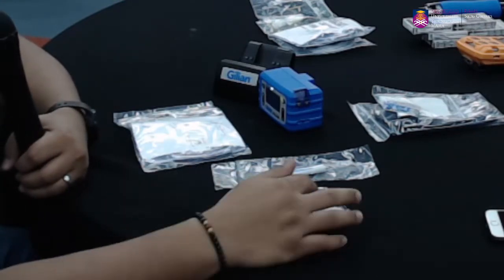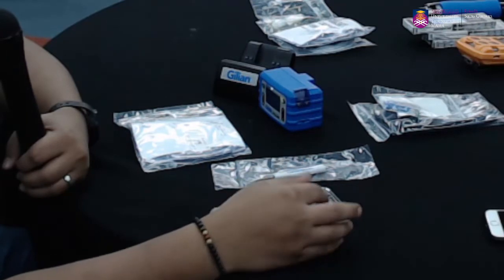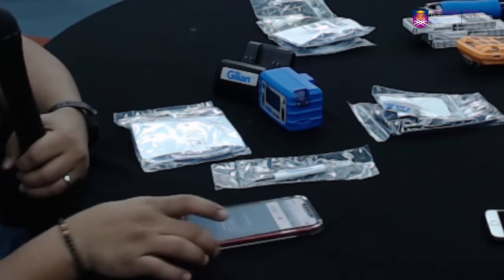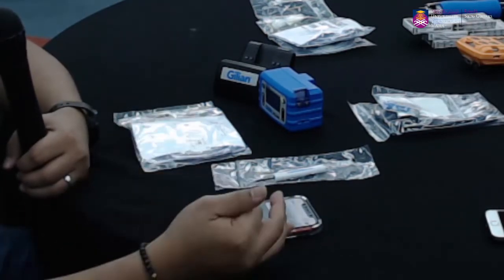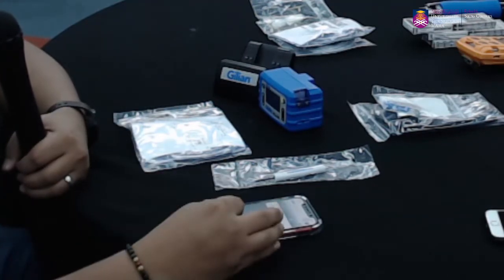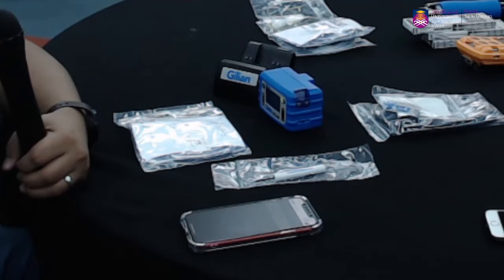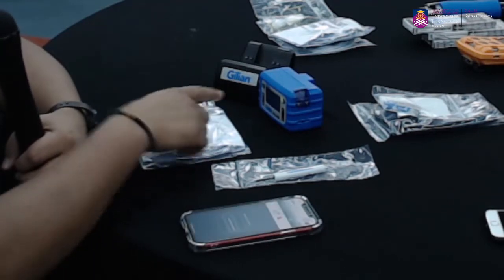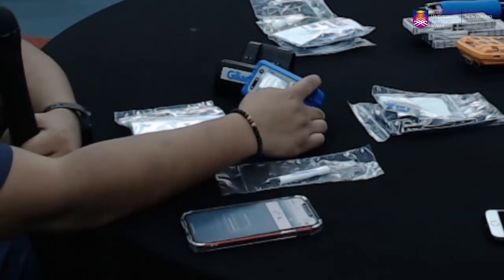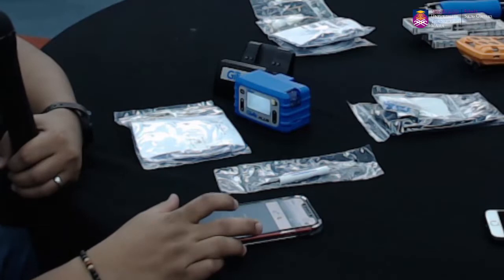And then also the additional part is that kita actually boleh stopkan the pump from kita punya unit. Okay, so daripada sini I dah tekankan passcode tu is 0000 saja. So kalau contohnya I nak pause the sample, nanti dia akan pause lah. So daripada screen kat sini pun kita boleh tengok continue ataupun stop. It's our selection lah.